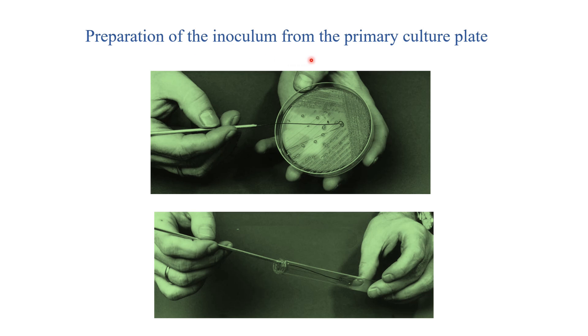Preparation of inoculum from primary culture plate. So, this is the primary culture plate. Here you can see there are so many colonies in the primary culture plate and each colony represents a single type of organism.